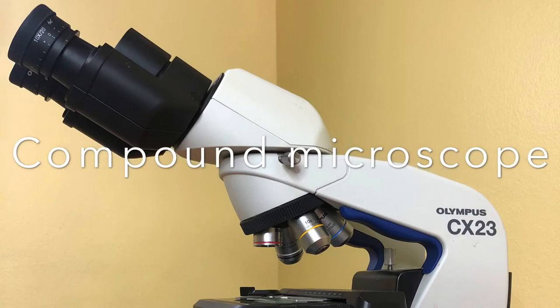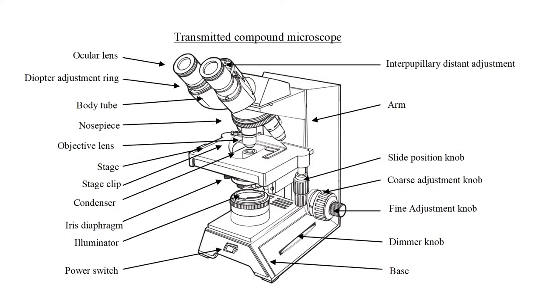Now, let's see a picture showing basic components of the microscope. Please see your lab manual for the full description of the parts.